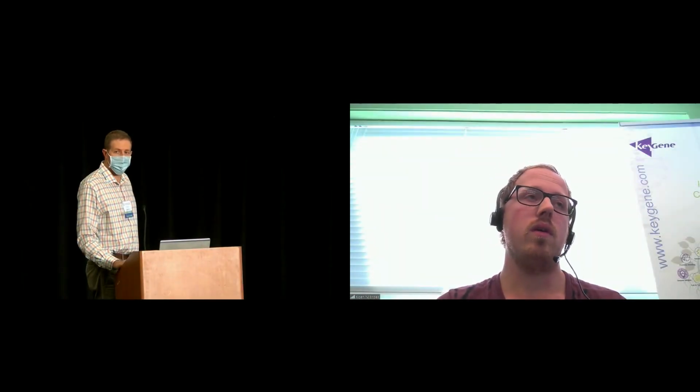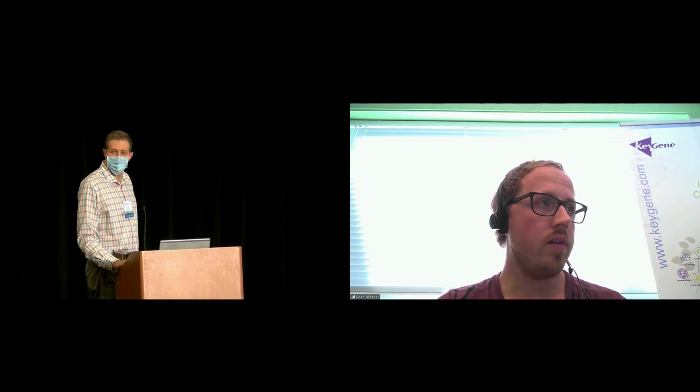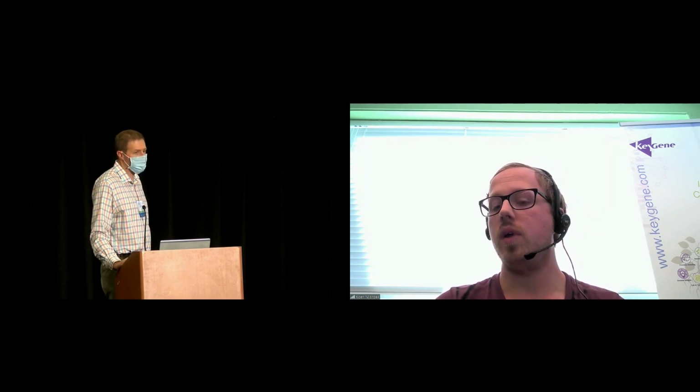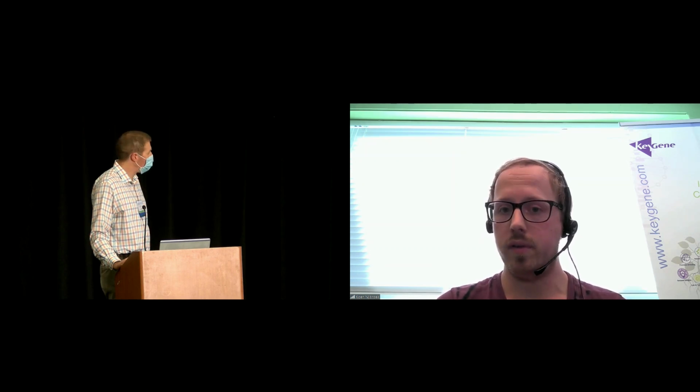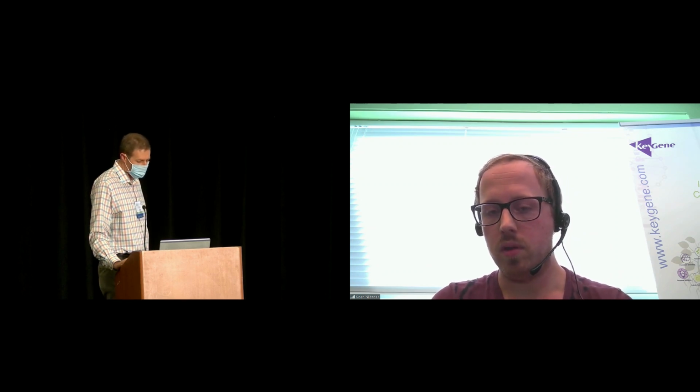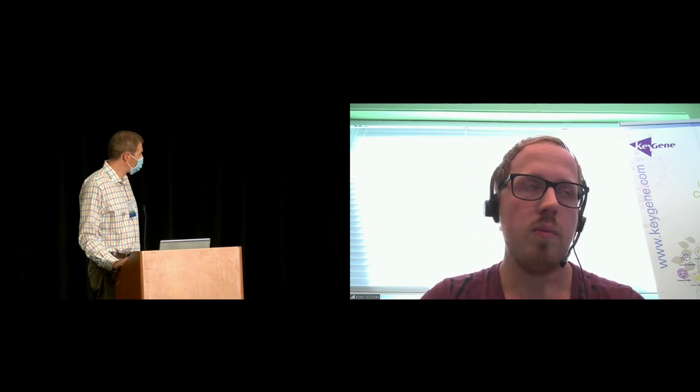And later on in the third section, we will go into extensive detail on what types of data can be put into the system, so that you know how to generate the proper data files for KeyPedia. Basically, KeyPedia can handle every common format. However, as soon as you deviate from that format, then KeyPedia will not accept your input data.